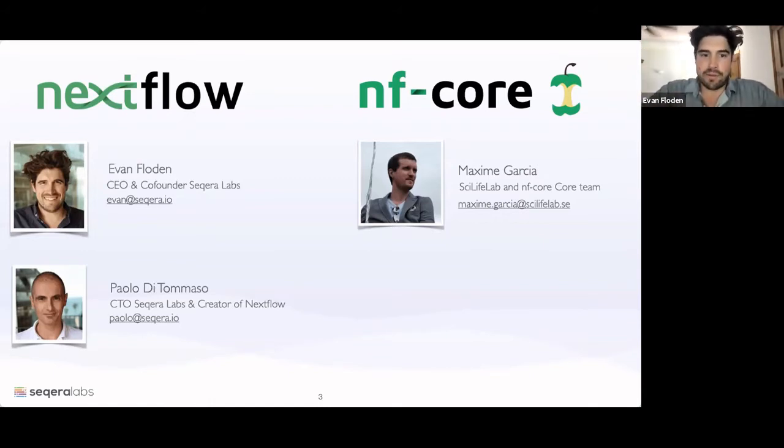It was a slow project, beginning very slowly over time, and started to get some organic growth. Then around 2017, we started to see interest picking up, and obviously now workflow managers have become very popular. Nextflow in particular has really risen a lot. I really loved working with Nextflow, and at the end of my PhD I didn't want to stop this. So we created Seqera Labs, as an open core company, with Nextflow at the heart of it, to build everything around that.